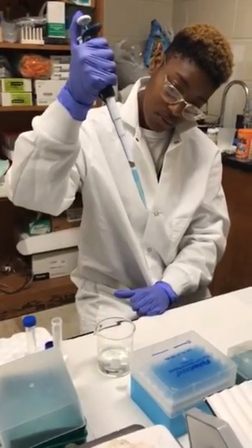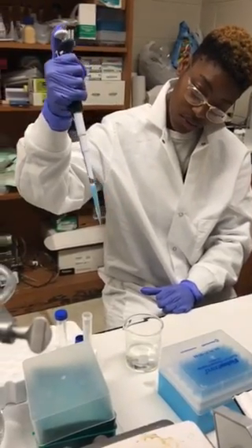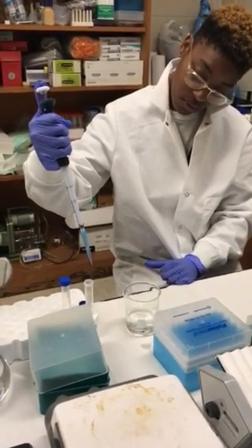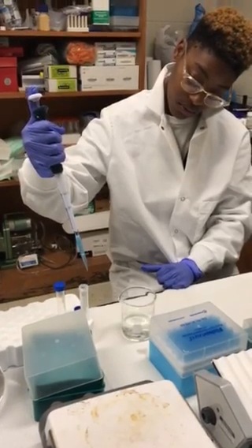Do not let the plunger snap back after collecting solution. If the plunger snaps, this can cause damage to the barrel. Be cautious not to lay down the pipette while liquid is in the tip. By laying down the pipette, this may cause damage to the barrel and contamination with future experiments.